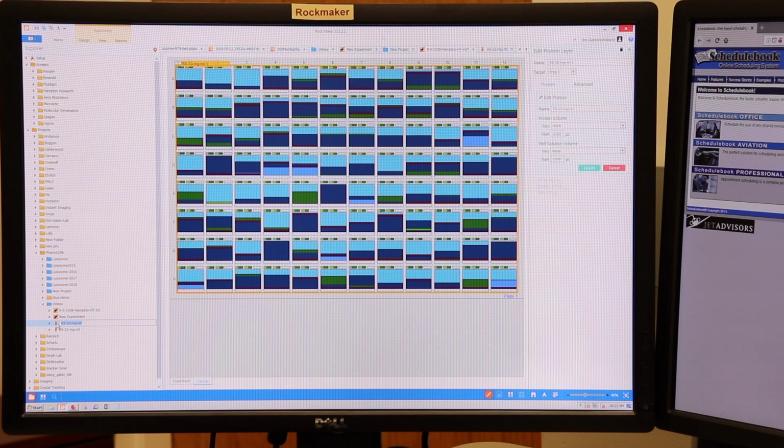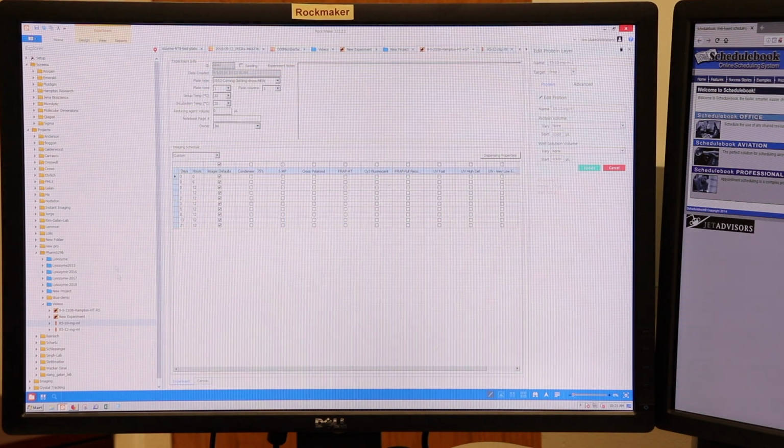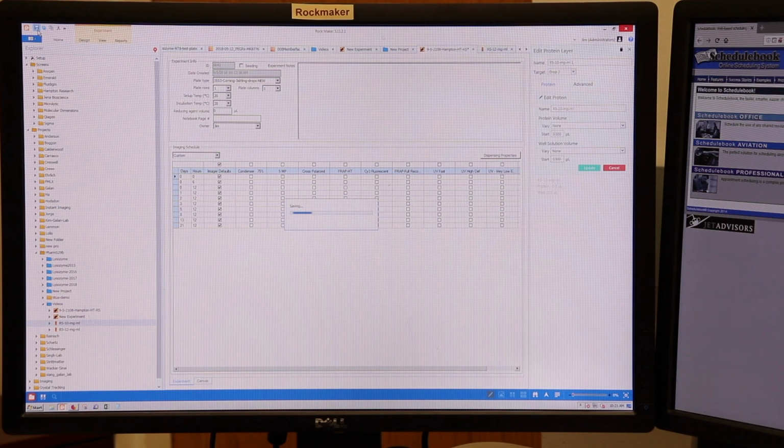Now drops 1, 2, and 3 in this software are the same as the ones in the NT8 software. The Mosquito refers to them as drops 2, 3, 4. So once you have your drops set up, we'll save it. Now if you only use 1 or 2 of the drops, when you set up the tray, just leave the other ones blank so you're not taking pictures of empty wells. So go back to experiment, push save.